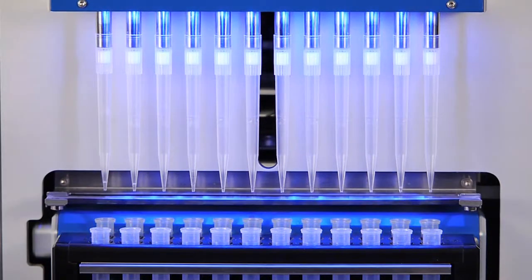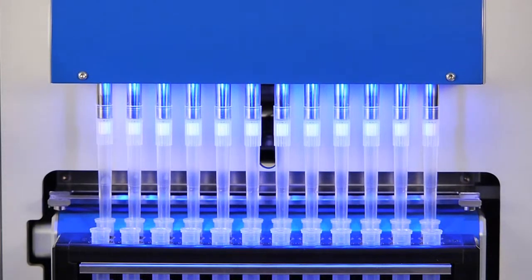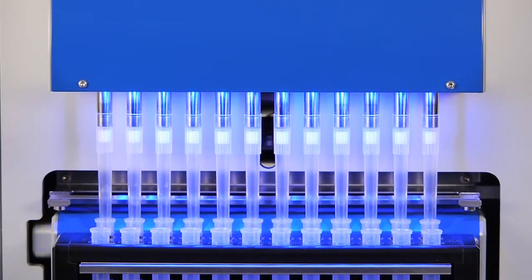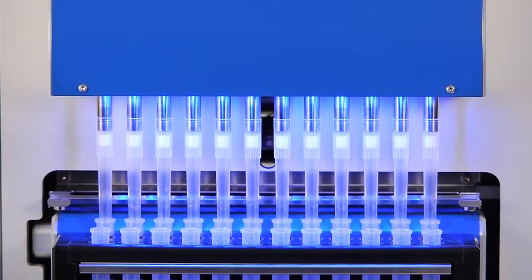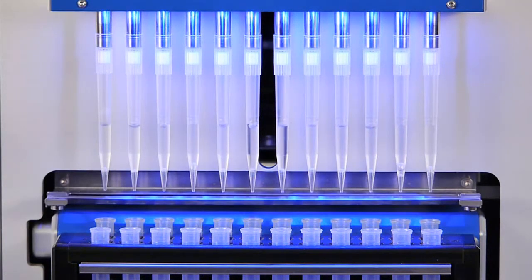Afterwards, the process of magnetic separation is started. The integrated magnet causes the beads to form a pellet at the lower rim of the reaction tubes. This bead pellet now contains the extracted DNA, whereas proteins, cell fragments, and other impurities remain in the liquid phase. This liquid phase, or supernatant, is now discarded into the liquid waste container.